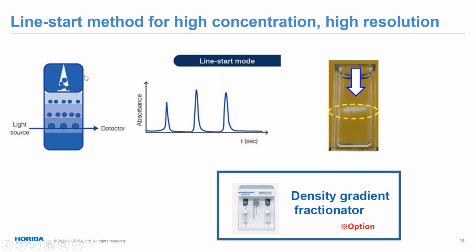And again, what that does for you is that you're going to have the particles separate nicely going through that higher viscosity liquid, so that the large ones come out first, then slowly the medium size will work their way out, and last but not least, the small particles will work their way out. But once you get them separated up at the top, you don't need a whole lot of viscosity to keep them separated later on.